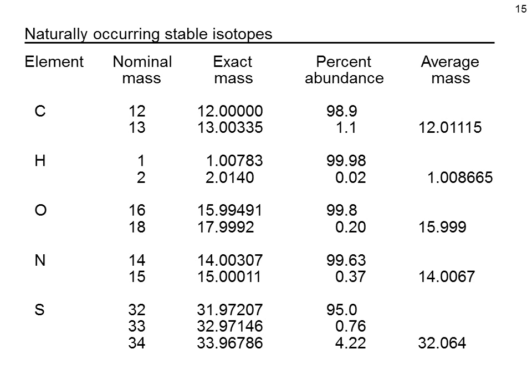Look at the other isotopes. We have hydrogen with its heavy isotope deuterium. This is twice as heavy. Exchange of hydrogen for deuterium is often used to generate internal standards for mass spectrometry, as they have about the same physico-chemical properties but differ significantly in mass. Thus these are ideal to normalize and correct the intensity in mass spectra and to translate them into concentrations, for example. There's only 0.02% of deuterium in nature, so it's a very minor isotope.